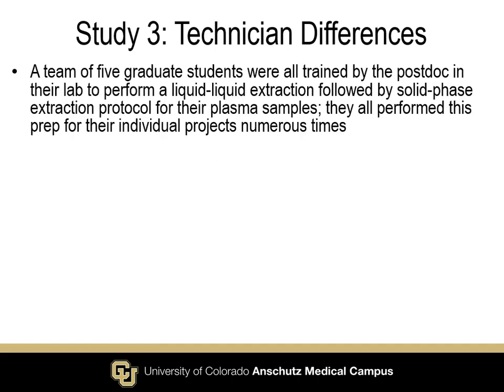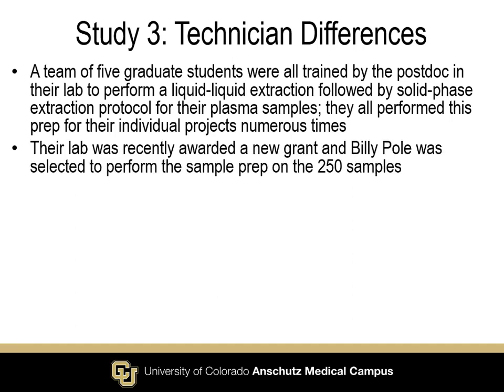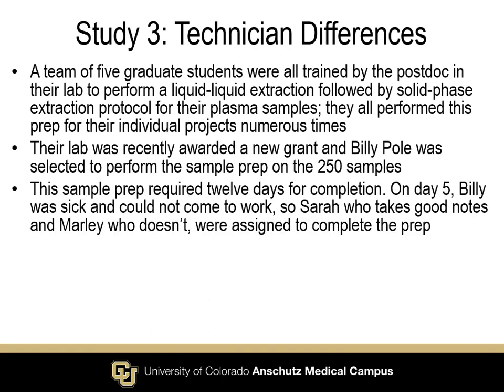So we have a team of 5 graduate students. They're all trained, well trained at that, by the postdoc in the lab to perform a liquid-liquid extraction, followed with some SPE for plasma. And they've all done it a number of times, so it should be second nature to them. So they got a new grant, and one of the graduate students was selected to perform the sample prep on a large number of samples.